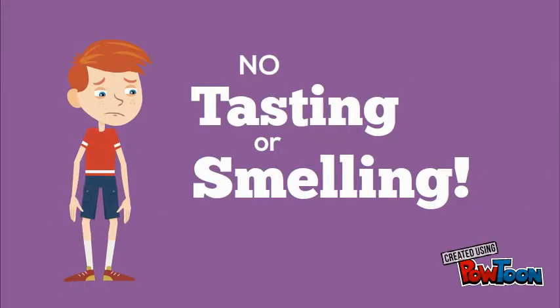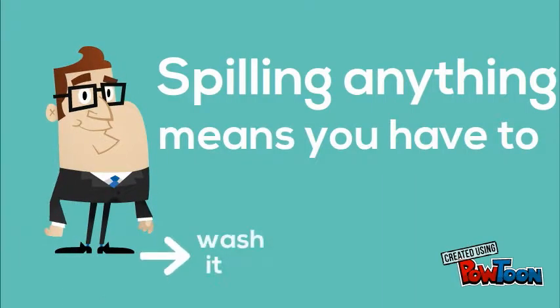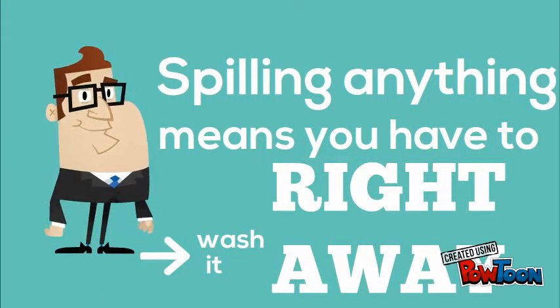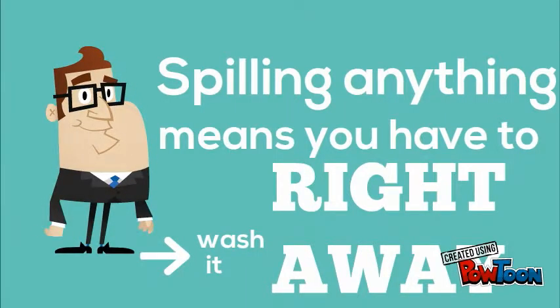Make sure to never taste or smell anything. In case you need to know the smell of a substance, make sure to waft instead of directly smelling it. If you spill a substance on yourself, make sure to wash it right away. In case you were being stupid, not wearing goggles, and something got in your eye, use the eye wash. It doesn't matter if you don't like water in your eyes. It's better than losing them forever.